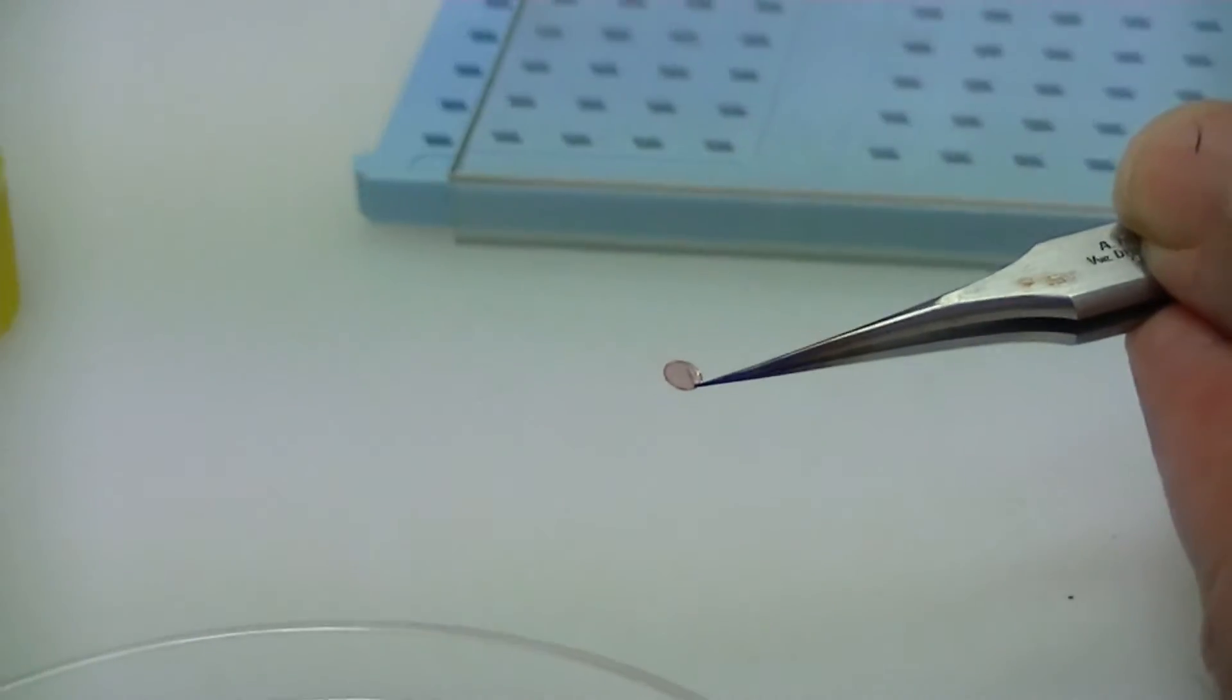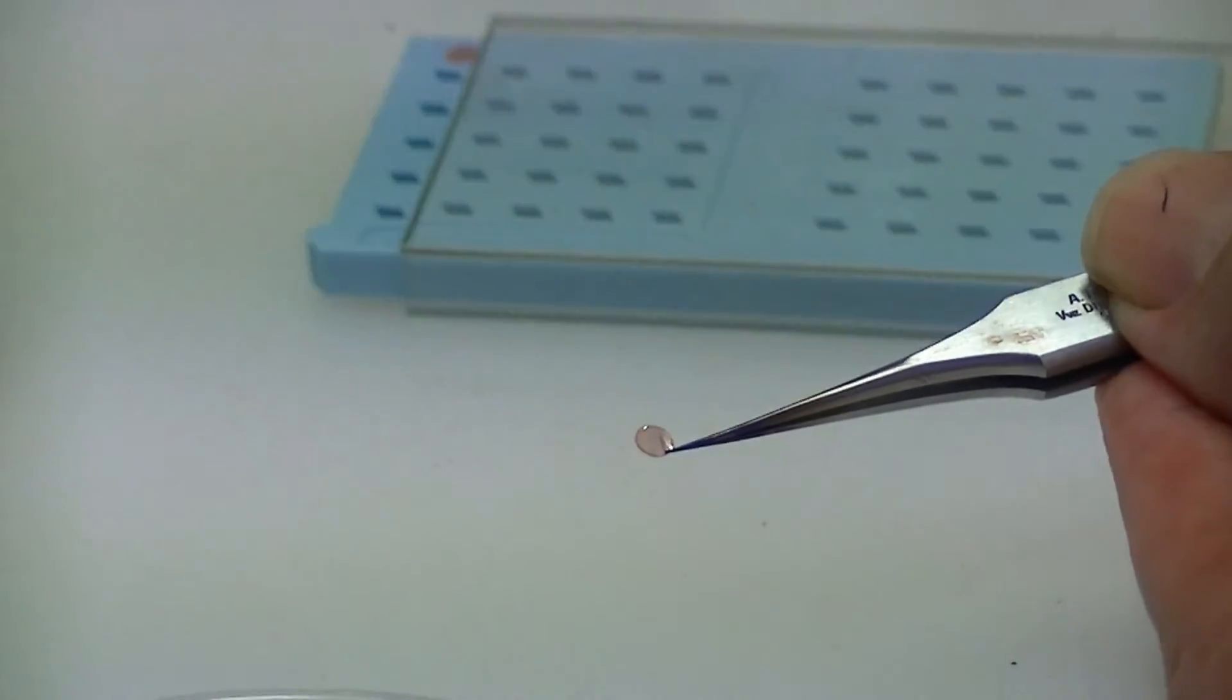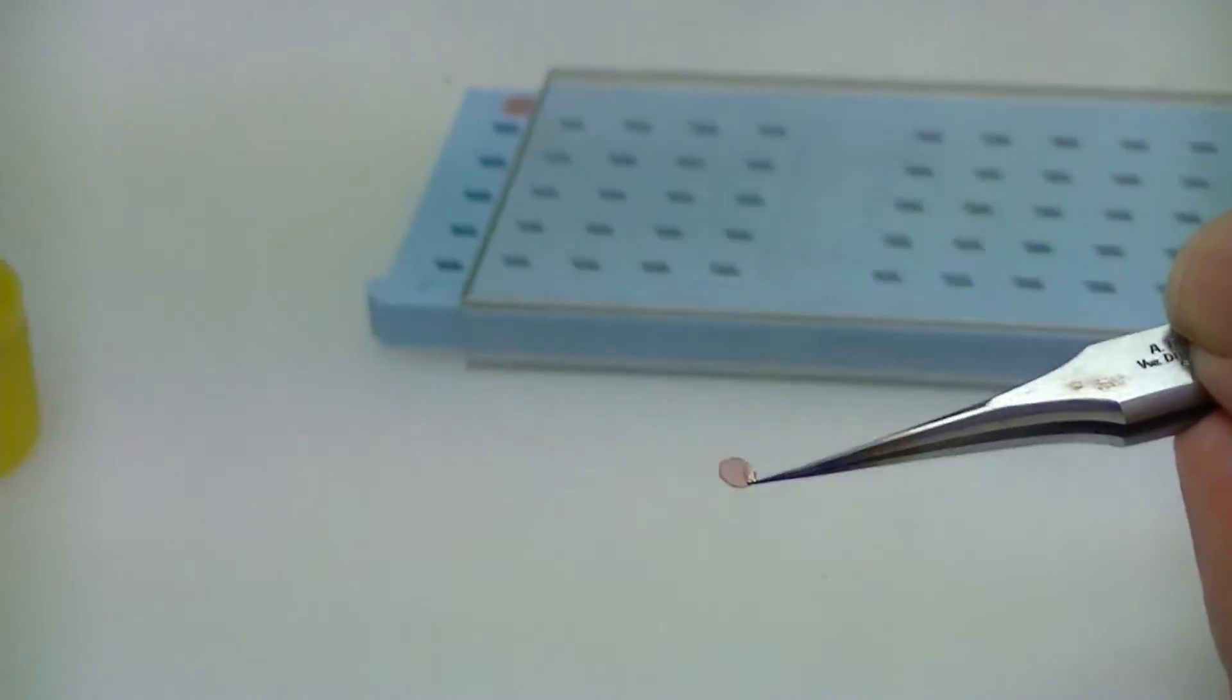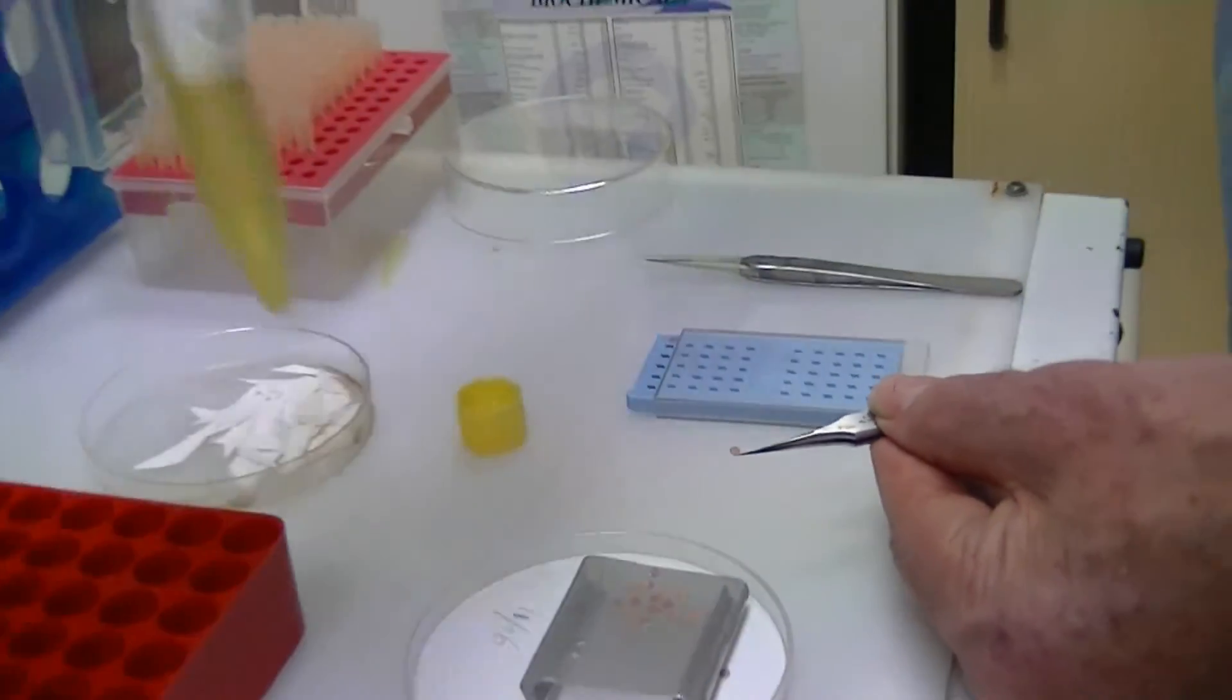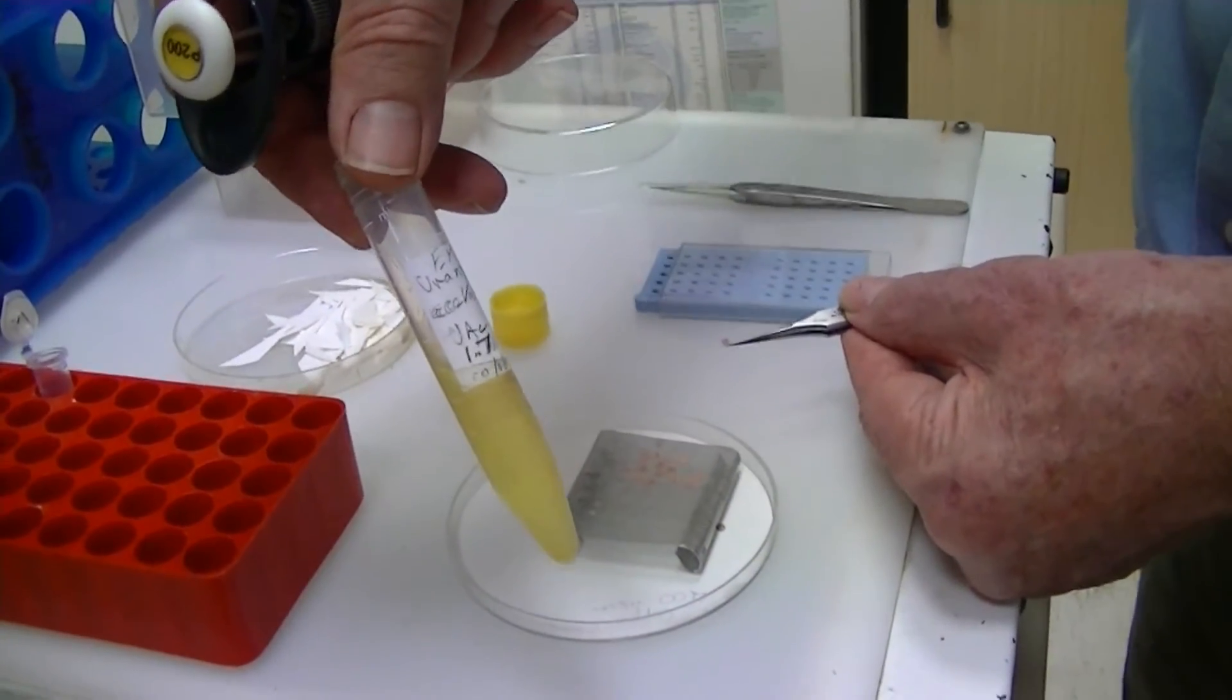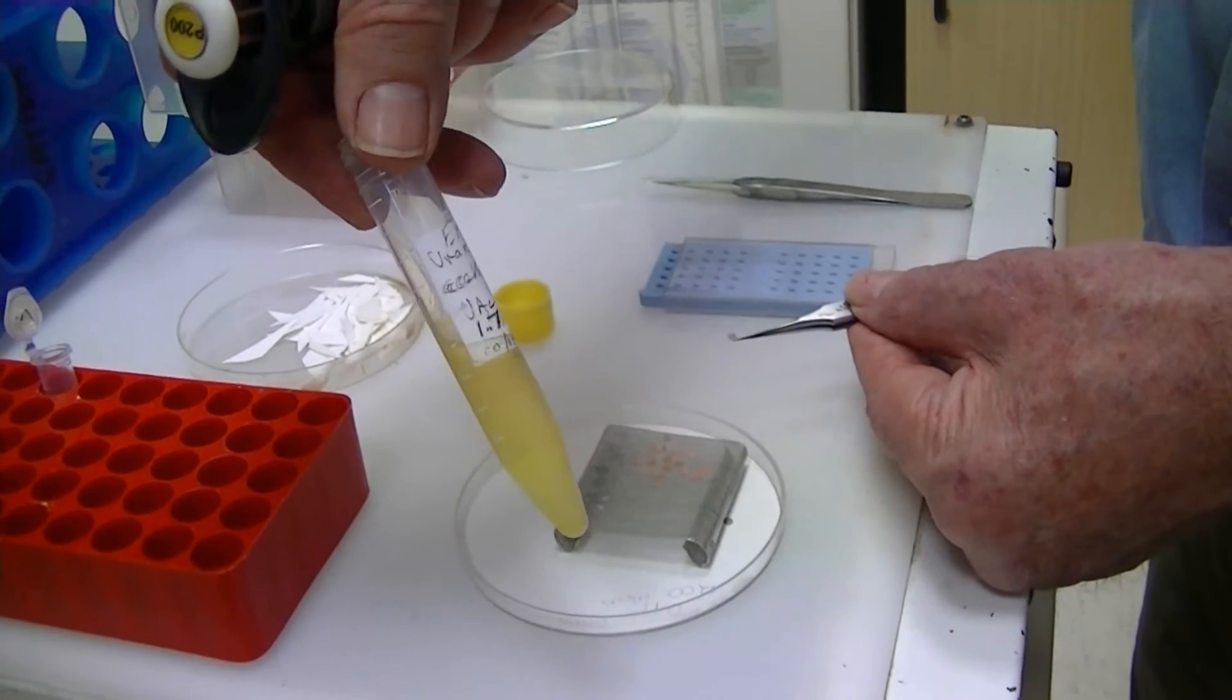Now to actually see the particles, we have to stain them with a negative stain. This is an example of one of our negative stains - uranyl acetate, around 2% in concentration.